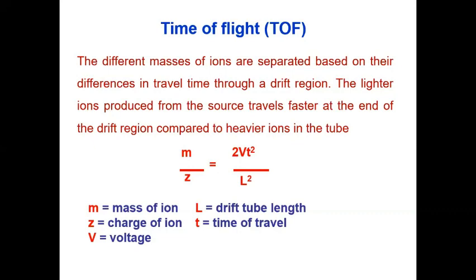Okay, then we have the time of flight mass analyzer. This is also a very important mass analyzer present in mass spectrometry. Here the separation of molecules, or detection of a molecular ion peak at the detector, depends upon the travel time in the analyzer, and that again follows a mathematical formula.